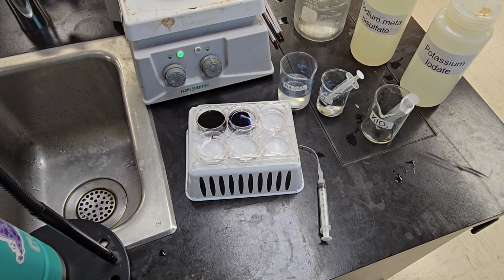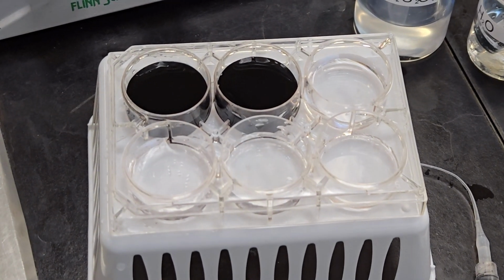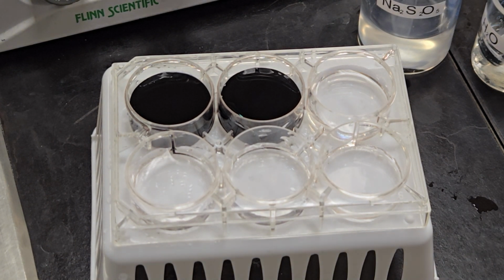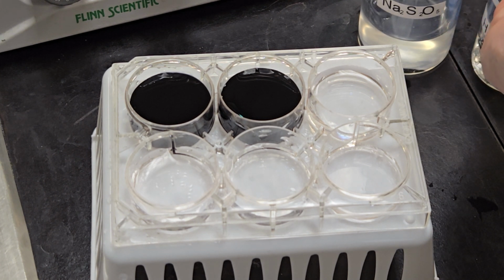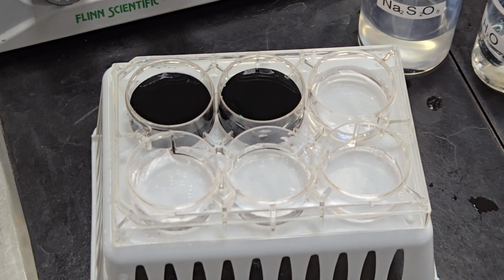Our reaction has started. Going to zoom in for you for the rest of them, since you don't need to see me pulling syringes over and over again. Going to number 3, I'm getting my 2 milliliters of sodium metabisulfate. 2 milliliters. Adding it to plate number 3.